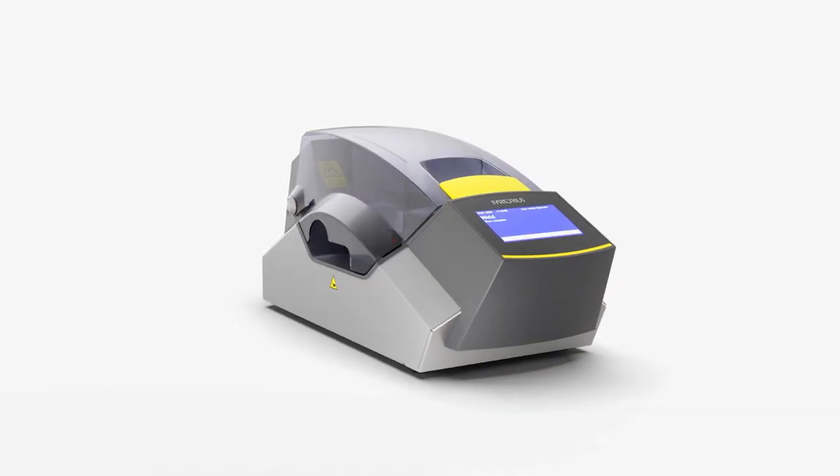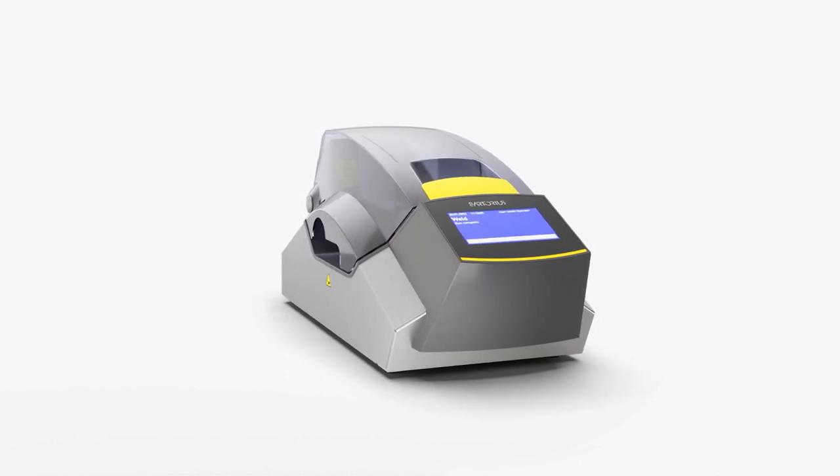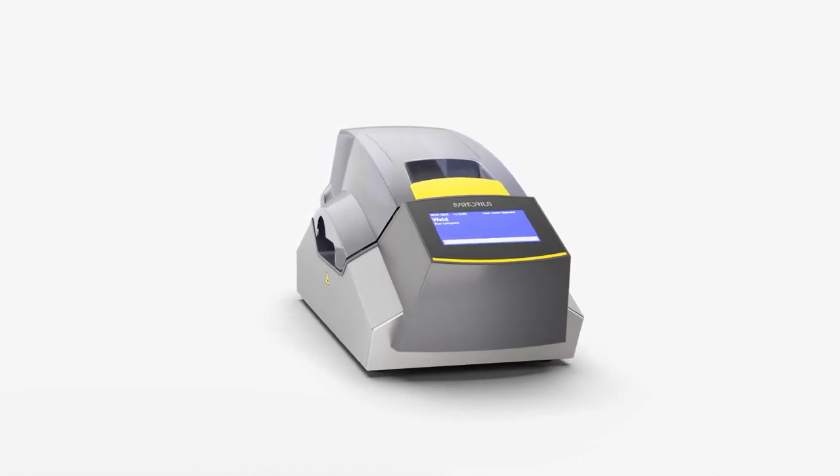Biowelder TC: a fast, flexible, and fully automated way to enhance your welding operation.